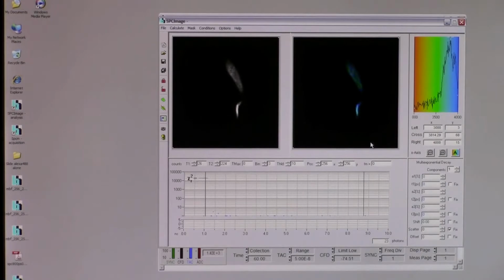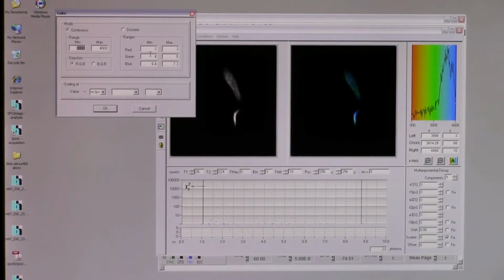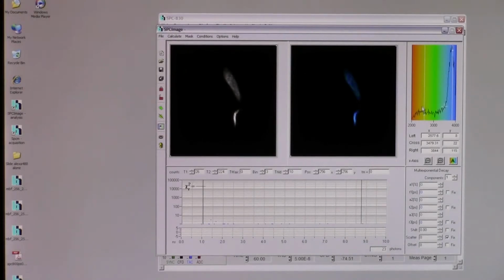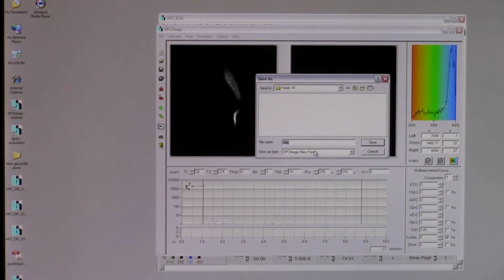However, if you want to be able to come back onto this computer and visualize this exact image in case you wanted to change the lookup table, say you wanted to change the range of actual lifetimes being displayed in my histogram, then you actually need to save this file here. And to do that, you go to File, and this is just File Save As. And so I will also save this as Control 1, so I know it corresponds with the chi, the T1, and the photon numbers from Control Experiment 1.